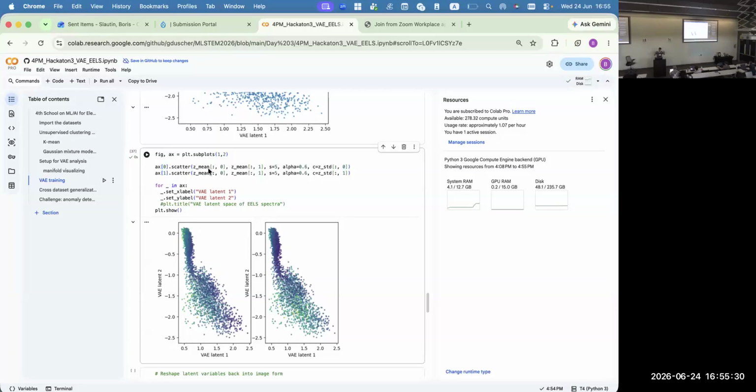So we put into correspondence to each input data a small distribution within the latent space, and you get both. You get the prediction in terms of the mean function of your object, and you have some standard deviation of the distribution. So the unique generative capabilities of variational autoencoders are actually somehow apart from this fact.